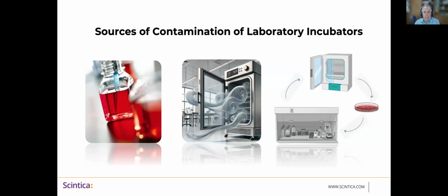The other thing is maintaining aseptic technique in all of your operations is really important. And in this cartoon on the right, we can see we've got a biohazard hood work area that is pretty cramped, filled with stuff, and that's going to affect the airflow within the biosafety cabinet and maybe reduce its effectiveness in doing its part of the contamination control in your laboratory.